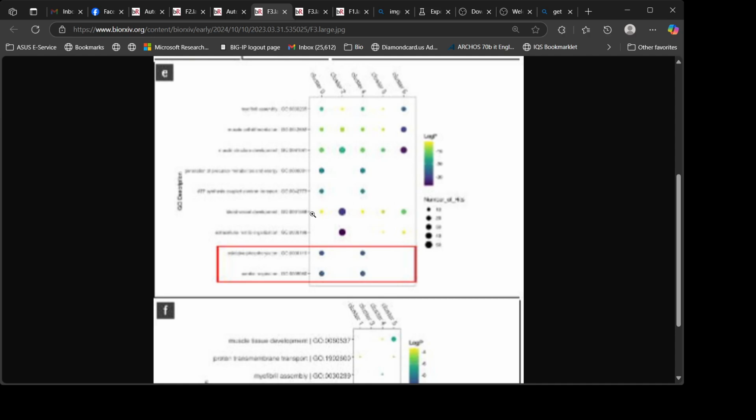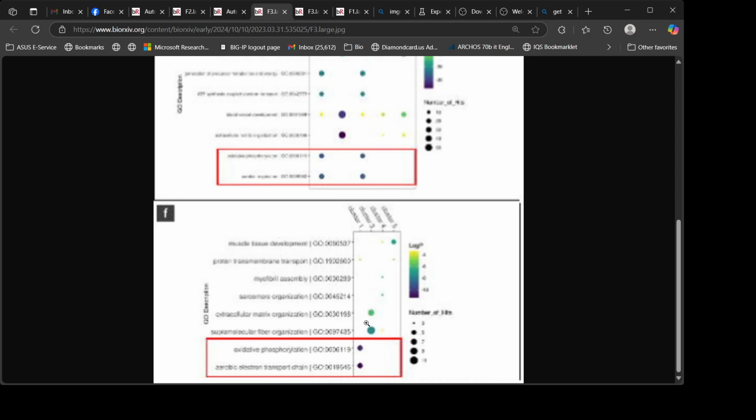Using the same analytical pipeline, this additional sample from MCH-TB302 displayed the same signature for upregulation of pathways related to aerobic respiration in clusters located in the center of the tumor, Figure 3f. Therefore, we demonstrate that VR-Omics provides a unique capacity for analyzing coplanar datasets to explore novel biological mechanisms in rare tissue sections. We were fortunate to have access to samples from a second patient to investigate the presence of the transcriptional signature across CRMs with distinct etiologies.